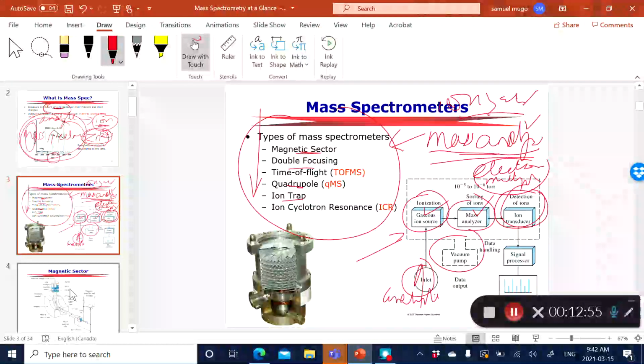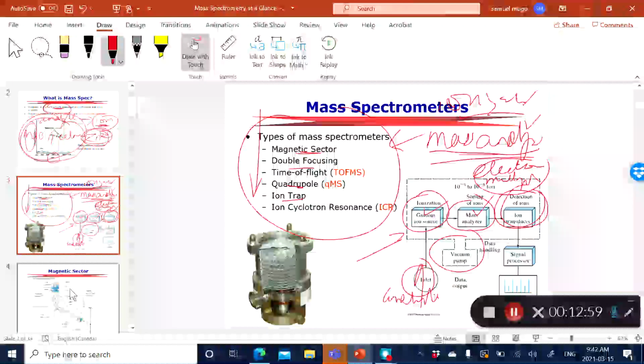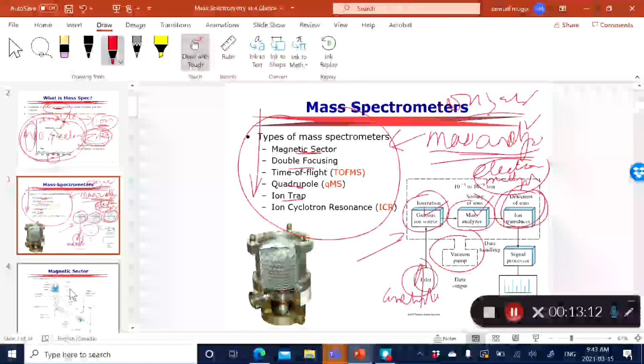It's in a vacuum. Of course, you can see why. Ions are very, very lightweight, so essentially you don't want them to be in an unstable environment with air and so on, because they become very unstable. So for you to be able to control an ion, you really want it in an evacuated, vacuum environment.